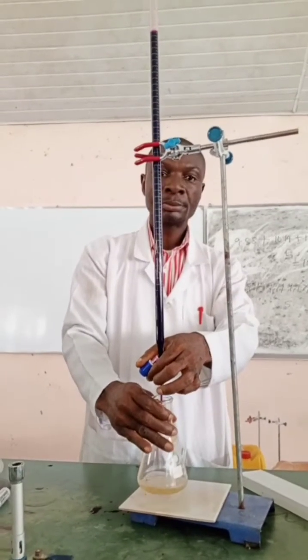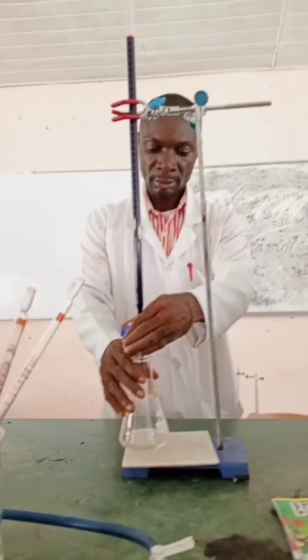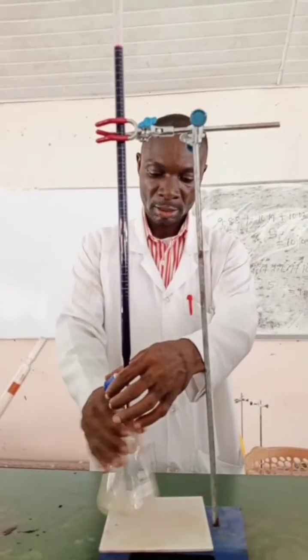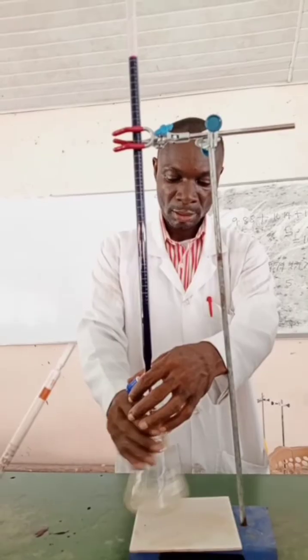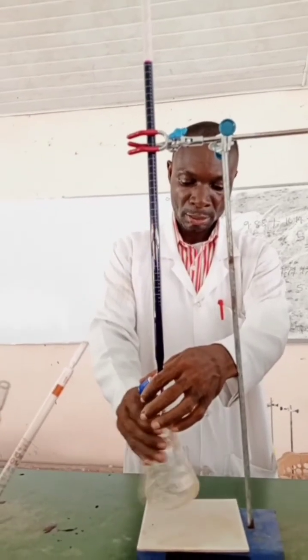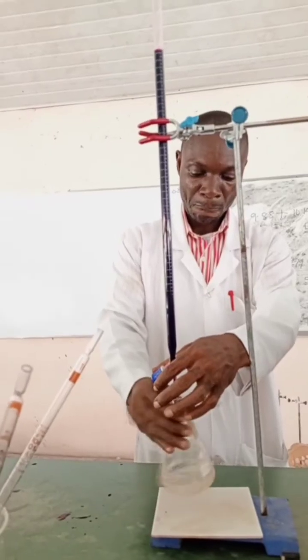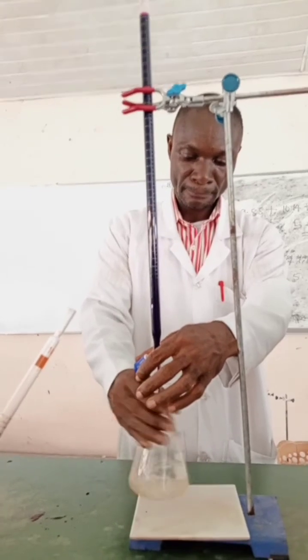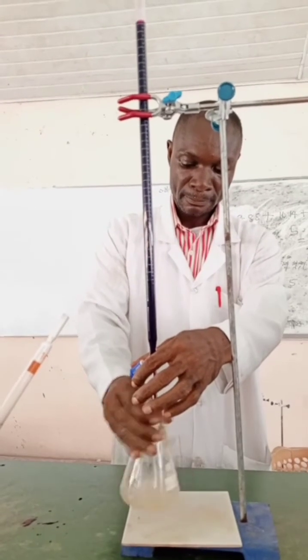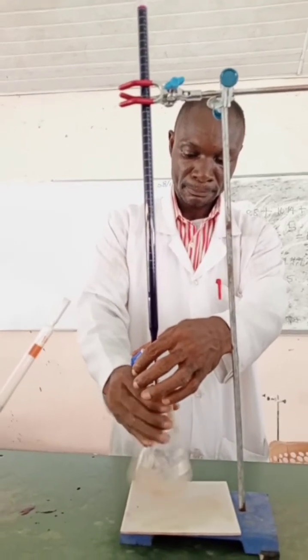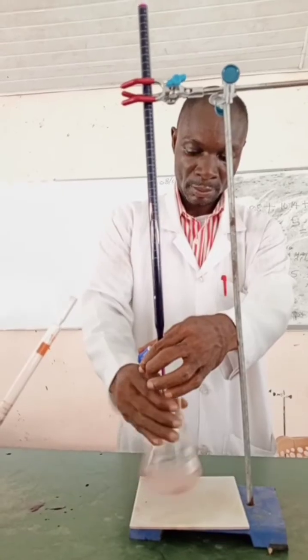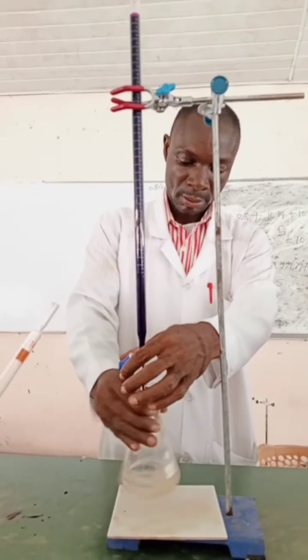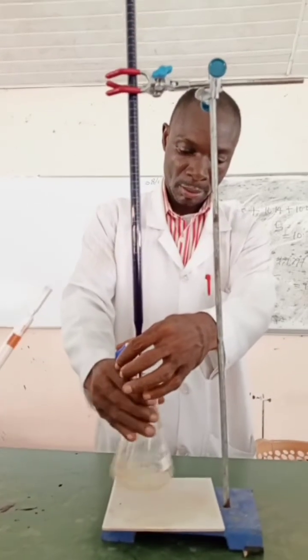Because we are titrating, we are expected to titrate until a permanent pale pink color is obtained — that is our endpoint. Until you get to the endpoint, you won't have a permanent pale pink. That is if you follow the rule carefully: the potassium permanganate has to be released dropwise, and you swirl vigorously for a quick discharge of the pink drop that appears when potassium permanganate is released into the reaction medium.